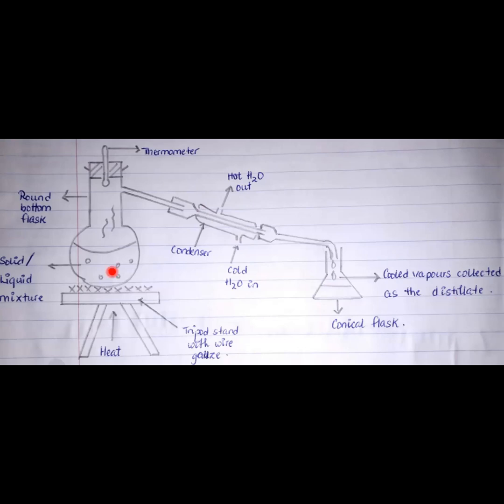So if we have seawater here, the water starts to evaporate. The salt particles remain at the bottom. The water is going to evaporate and move up through the neck of the flask itself, come down through into the condenser. The vapors are going to cool down, and over here you're supposed to get pure water. Now, at this point, I would like to show you a video because this is supposed to be done in schools. So let me get a video to show you.